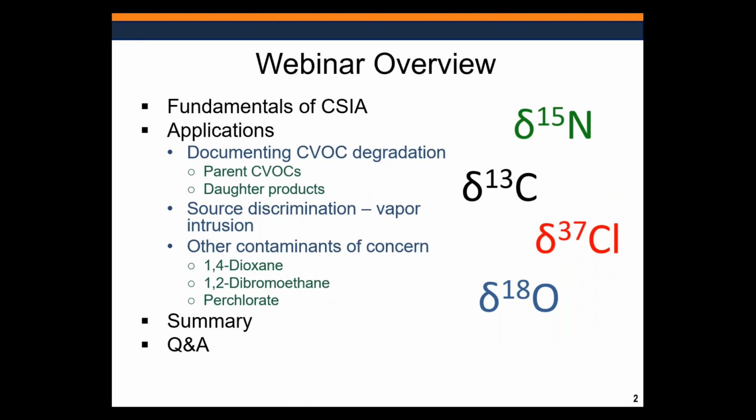So a little bit about the webinar. I'm going to talk about some fundamentals first, and then I'm going to go through how we can use this technique to look at degradation or sources of chlorinated solvents. I'll then talk about some other contaminants of concern, 1,4-dioxane, which everybody's interested in these days, 1,2-dibromoethane, which unfortunately very few people are interested in, but it's an important contaminant, and then perchlorate. We'll sum up and then do a bit of Q&A.